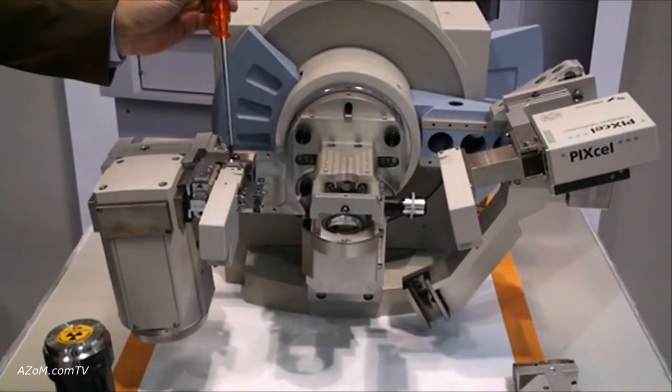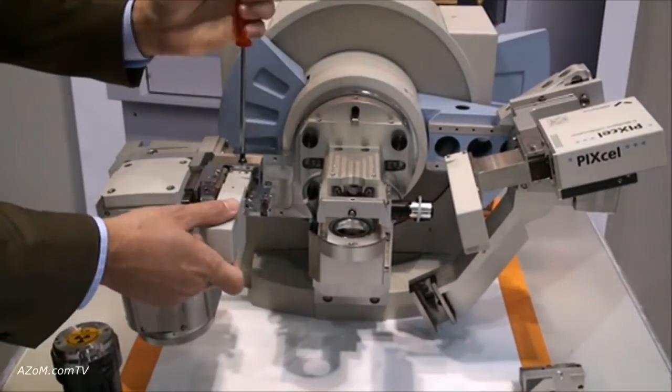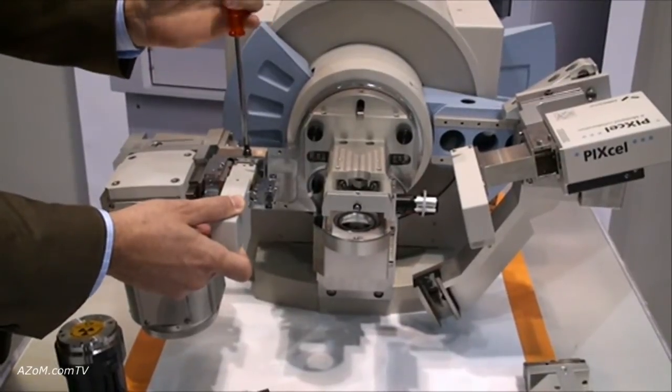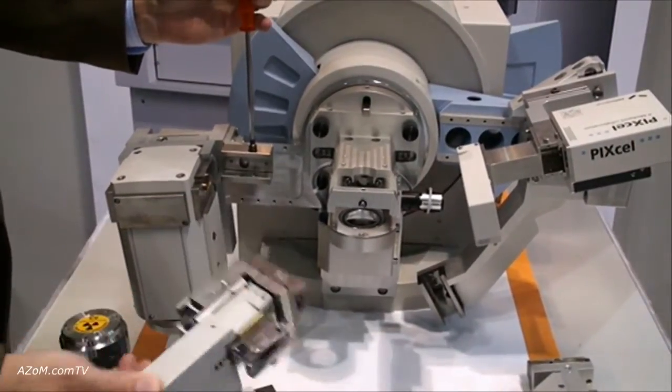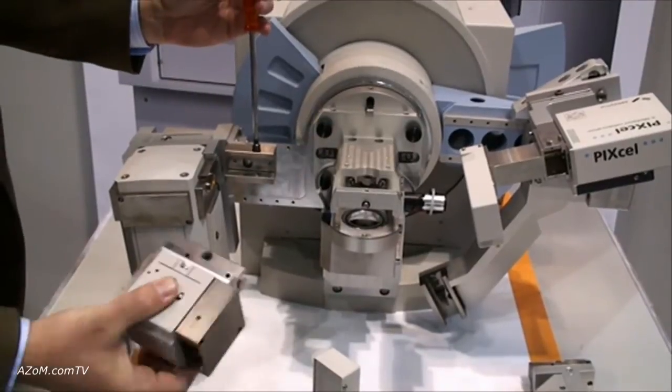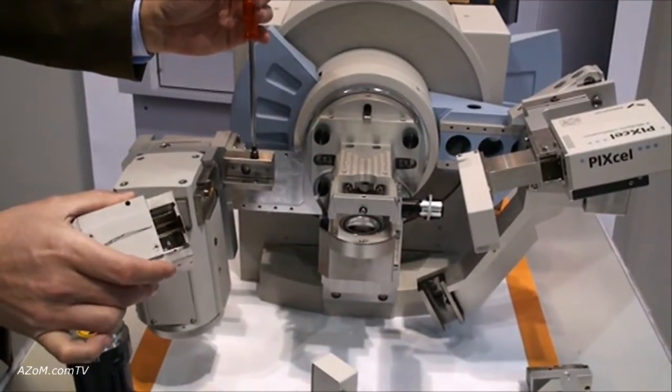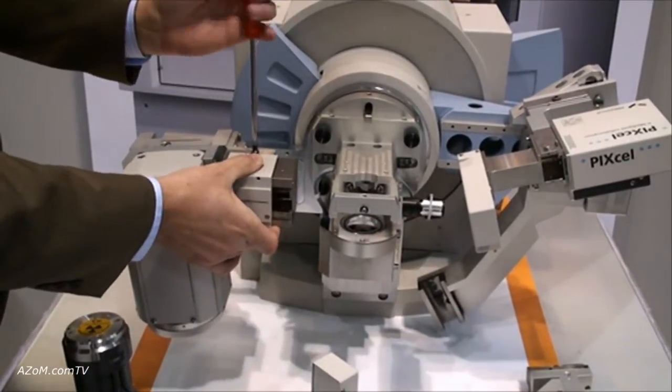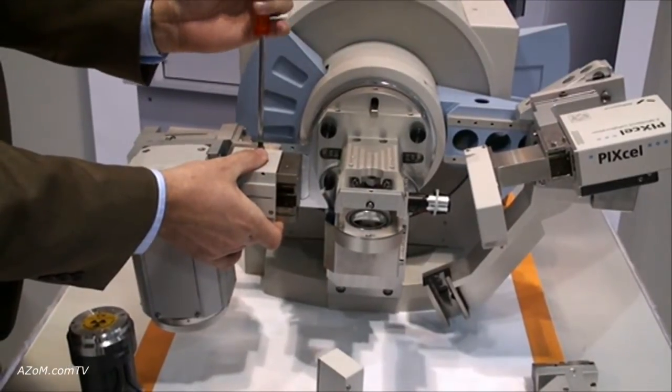we have hard kinematic mounting devices called Prefix mounts that allow you by the turning of one screw to take off an optic, reconfigure the system within seconds to in this case a focusing mirror for transmission X-ray diffraction analysis.